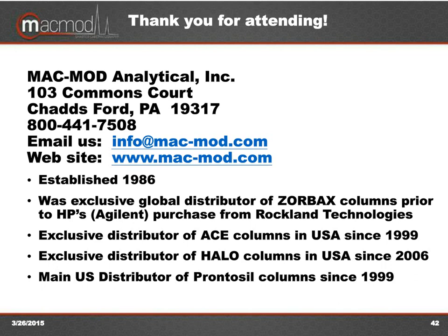Great, thank you, Tom. Our next question is, have you seen any instrument compatibility issues at the very high pH near 11? The highest I've worked on a consistent basis was 10.2, although I did do some work at 10.7.